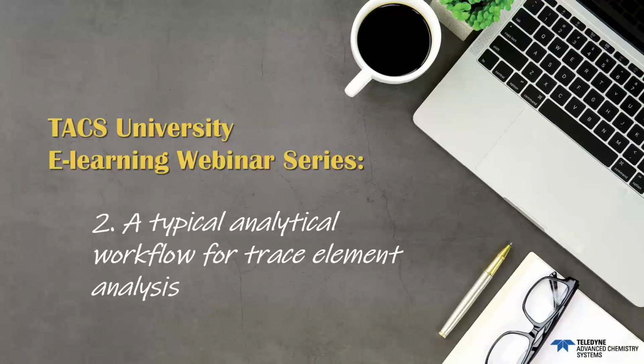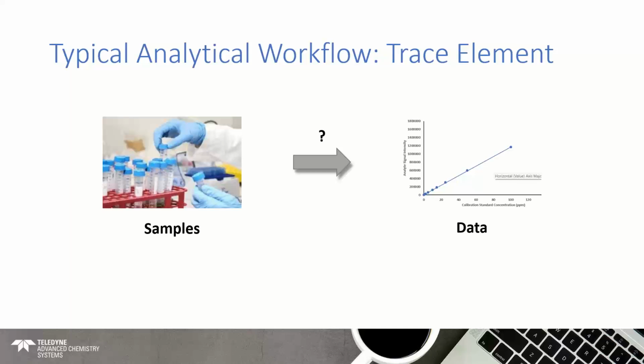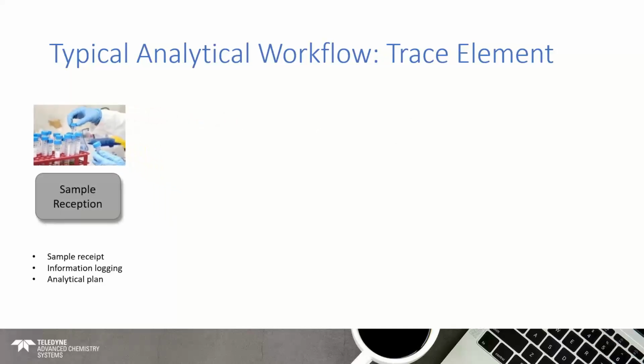So the workflow of a trace element lab. This is something that I want to focus on here, and then we'll move on from there and look at sample preparation specifically. So the workflow of the laboratory. Samples are delivered, they're received at a laboratory, and overall at the end we want some data. We generate data from these samples, which again will differ between different methodologies and different sample types. So how do we get from one to the other? How do we get from A to B? Well, there's a number of steps going from sample to data, and this is where we're going to start.